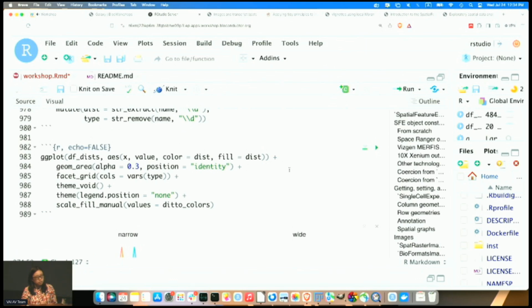Actually, yes, I think it's in the Voyager preprint. It's a bit old. I compare PCA, DE, and also Moran's I. I also compare with SquidPy for Moran's I. Also there's a student in my lab at Caltech, Joe Rich. I think he's going to give a presentation about a comparison between Seurat and Scanpy, although that's not for spatial, but I did that for Moran's I. At least that's what SquidPy, Giotto, Seurat and Voyager have in common.